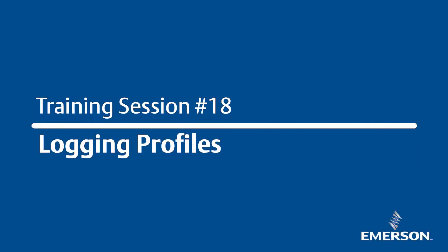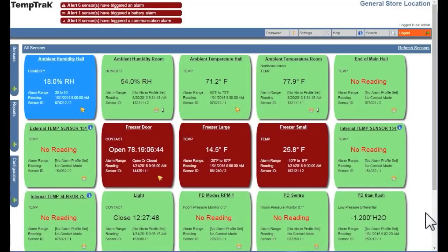This video will cover TempTrak's logging profiles. Logging profiles determine how often TempTrak will log a temperature from a specific transmitter and how the data is recorded.